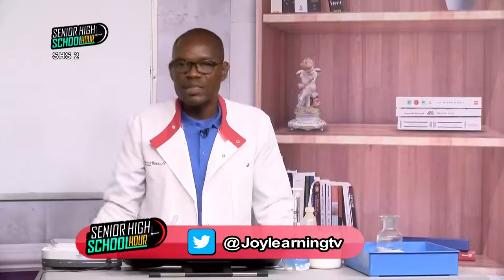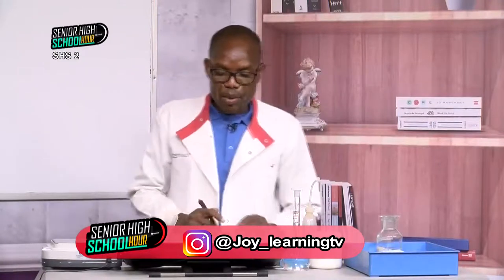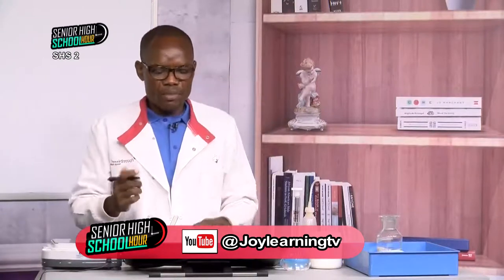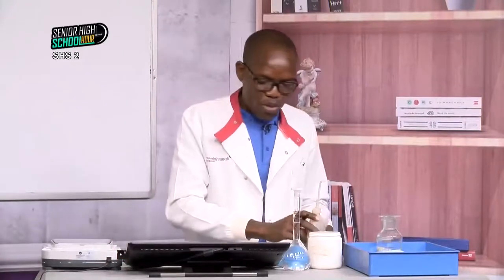What do I do? Last, you cork and then you invert like that. You shake it like that. Okay. So I'm done. But in chemistry, you need to label. So what will be the label? The name of the substance you have used for the preparation, and the concentration. You can add the date of preparation, and you can even add your name. So my label will look like this.